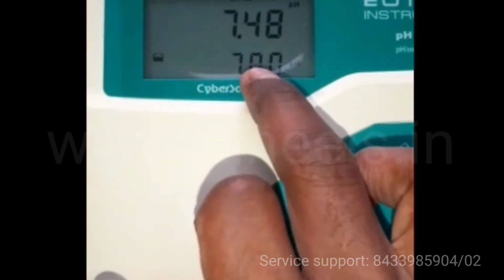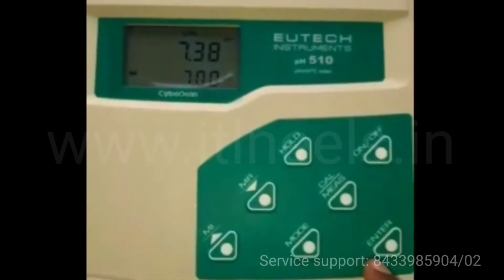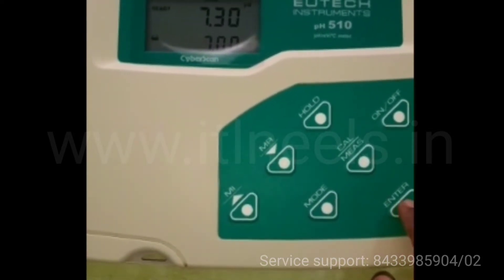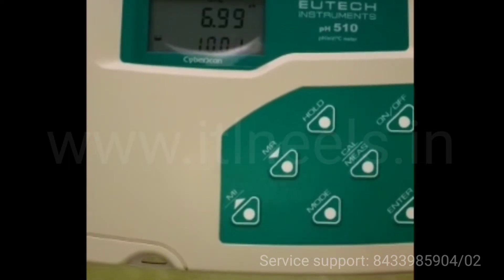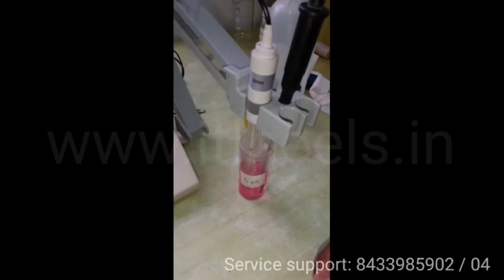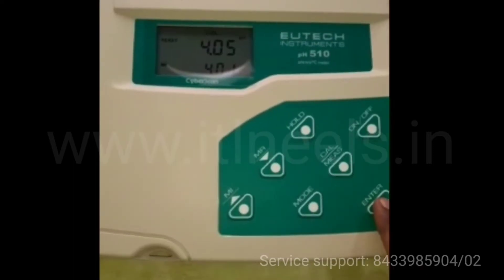Once it gets locked, the 7 pH value gets locked. After getting the ready indication you have to press the enter key. Then it will ask for other points. After cleaning the electrode, you have to dip it in the next point you want to calibrate. After getting ready, press enter.